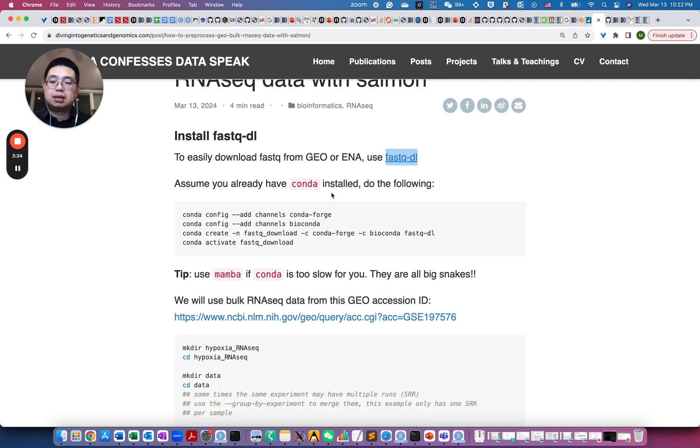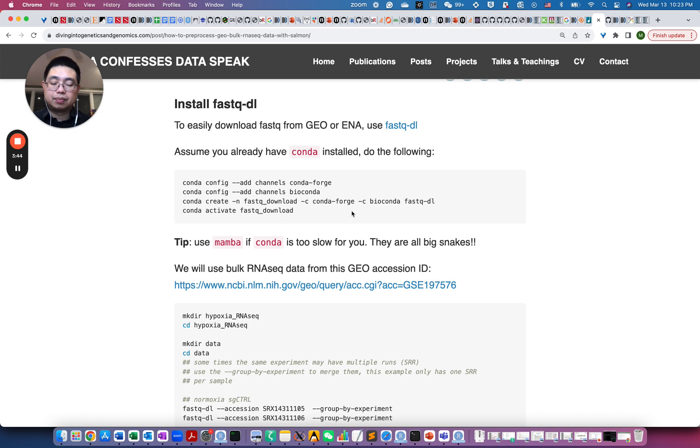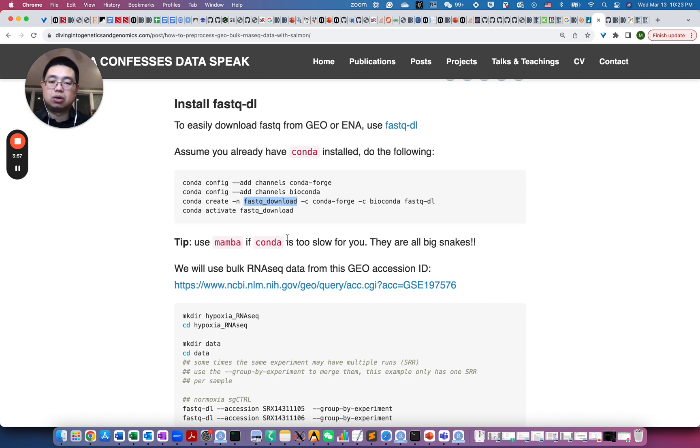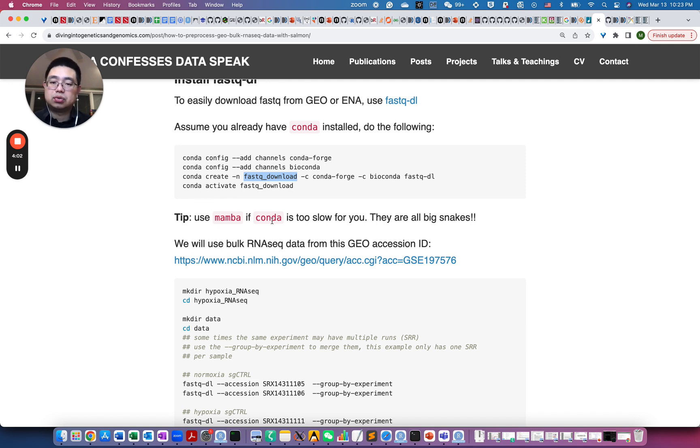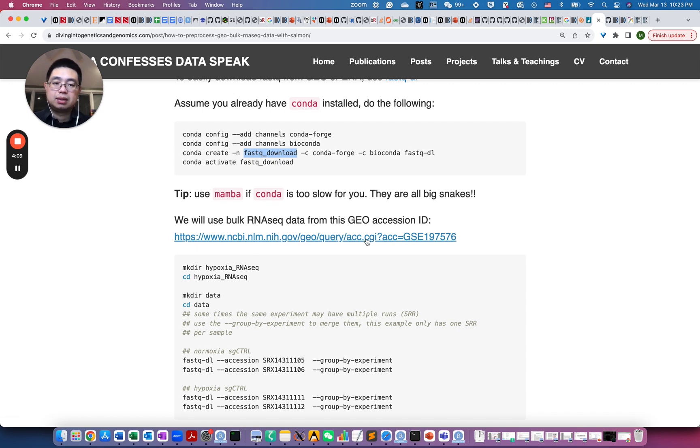So after you assume that you already have conda installed, then you just follow here to install the FASTQ-DL from the bioconda channel. And then you activate this environment, called FASTQ download, but you can call it anything. So just a quick tip here, if conda is too slow for you, you can use Mamba. So it's a drop-in replacement of conda, but it's much faster. But they're all big snakes.